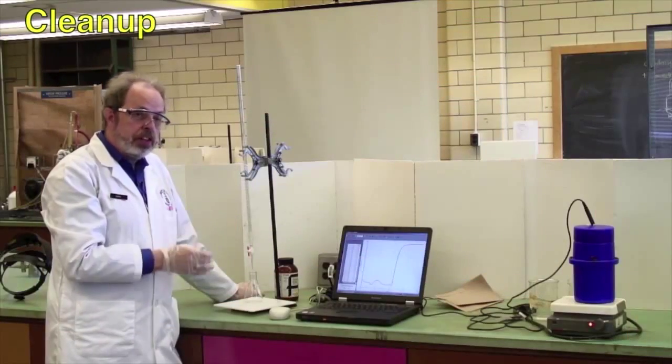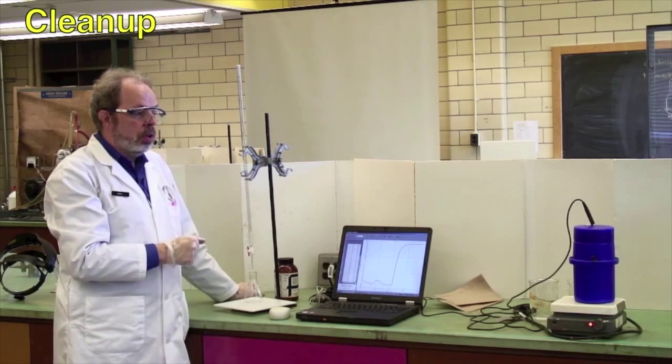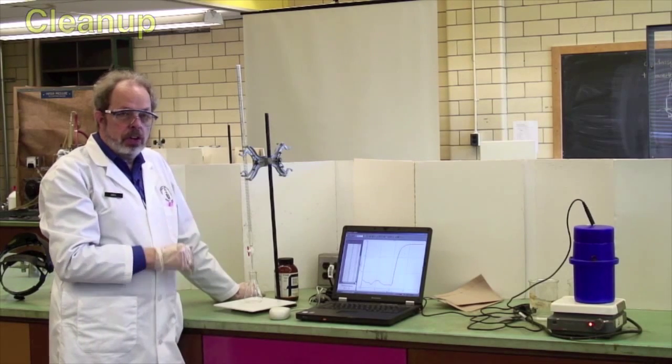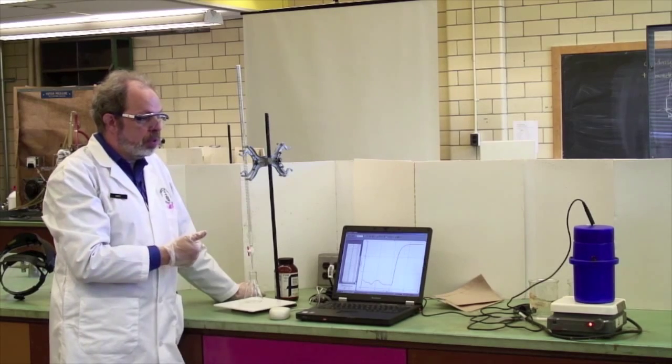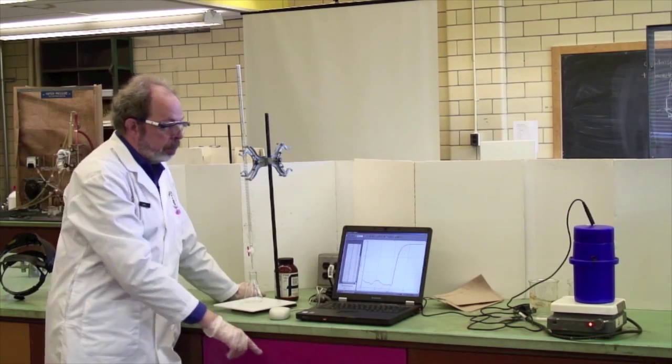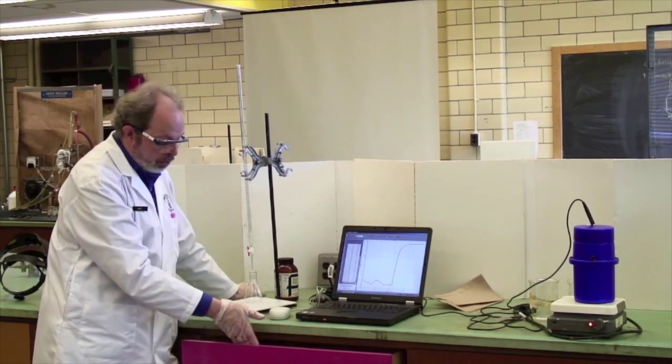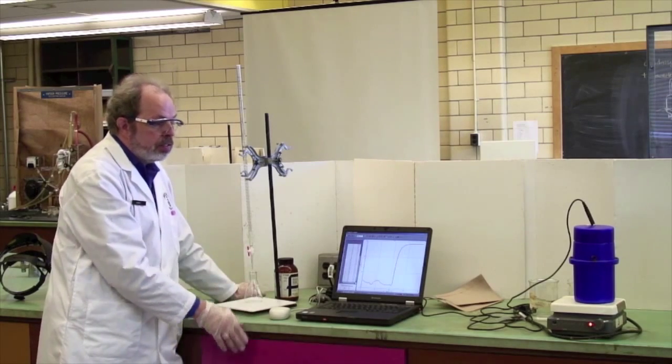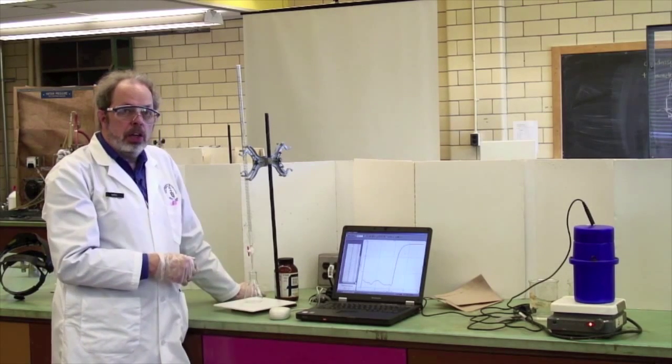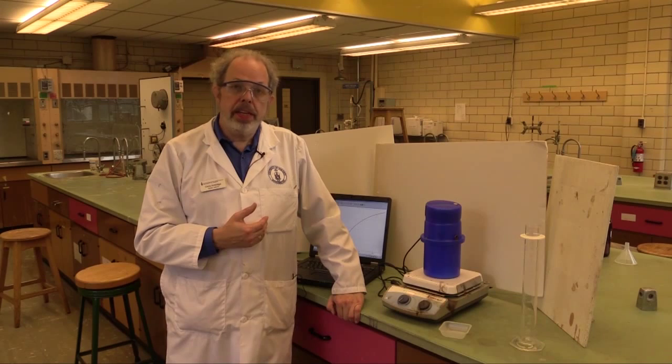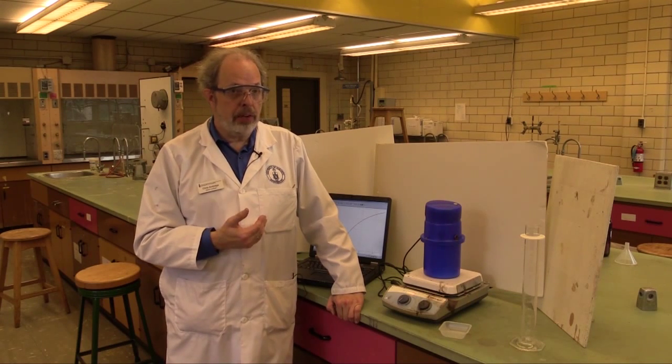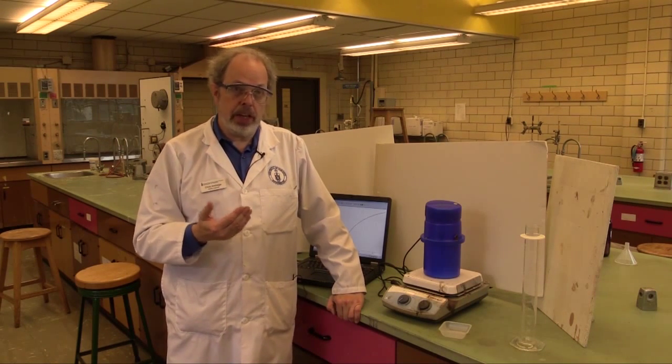Once you have finished this experiment, again, all of your finished solutions can go down the sink with lots of running water. Don't forget to turn the computer off. The hardware for the links actually lives in a box in these drawers here. The computer goes back to your TA. And that is how you collect your data for experiment T2, which is batch calorimetry using a solid unknown.